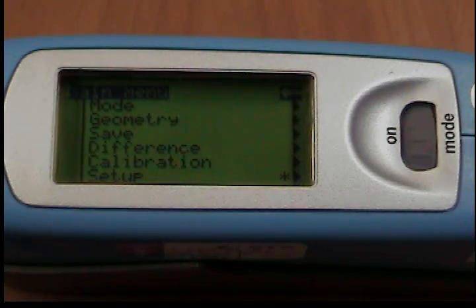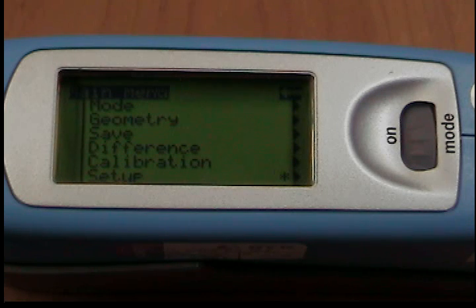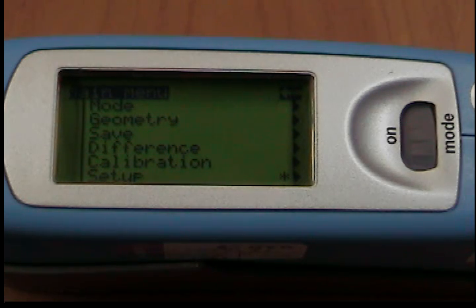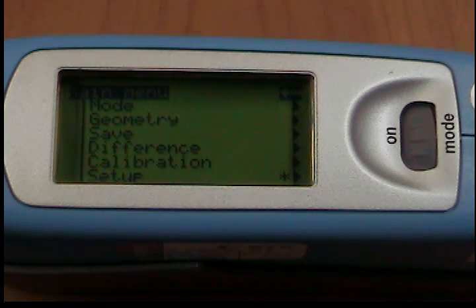How to calibrate your micro-tri-gloss gloss meter. You should recalibrate the device if ambient conditions have changed. This applies especially when changing location, if major changes in temperature and relative humidity may be expected as a result.